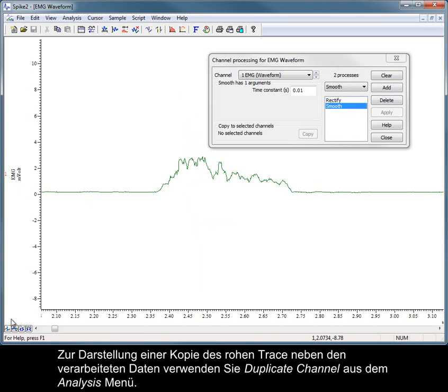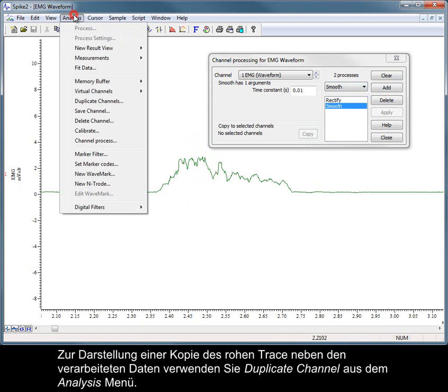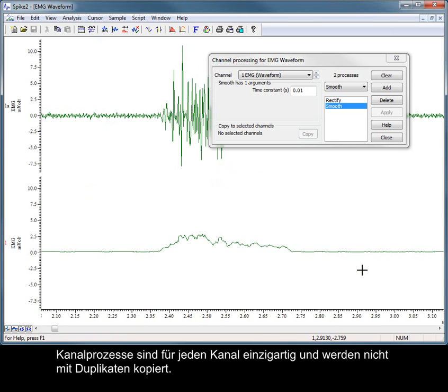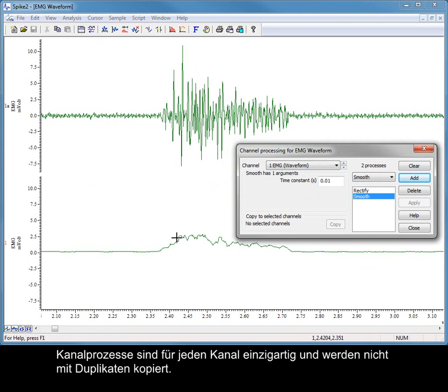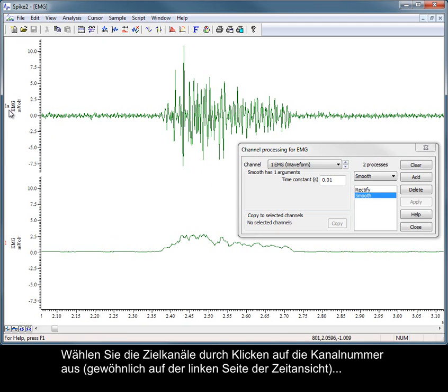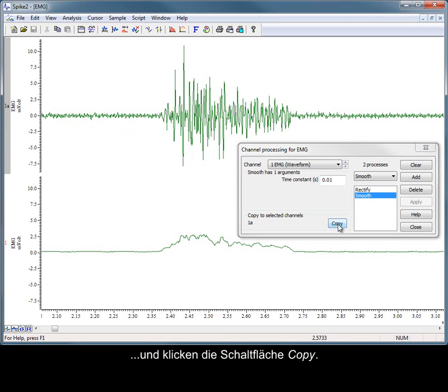To view a copy of the raw trace alongside the processed data, use Duplicate Channel from the Analysis menu. Channel processes are unique to individual channels and are not copied with any duplicates. You can copy all the processes set for the current channel to other channels in the file. Select the target channels by clicking their channel numbers, usually on the left edge of the time view, and click the Copy button.